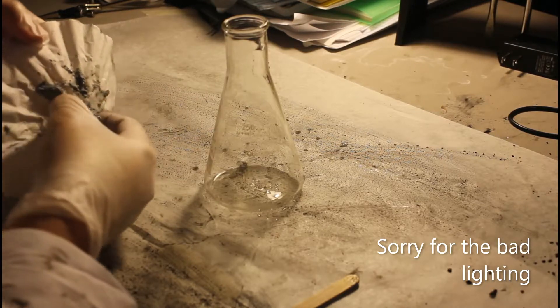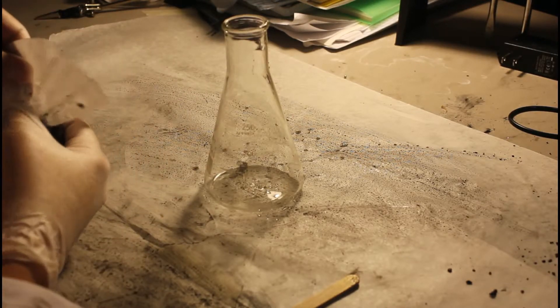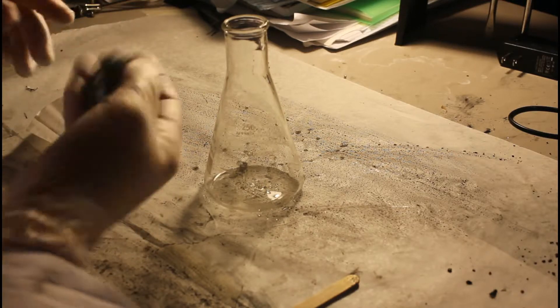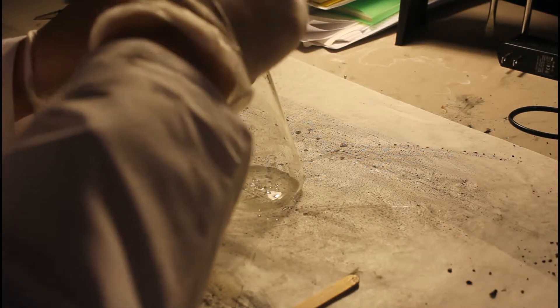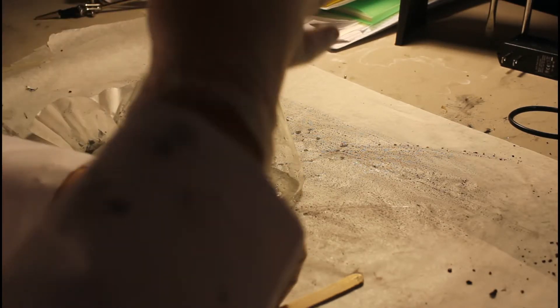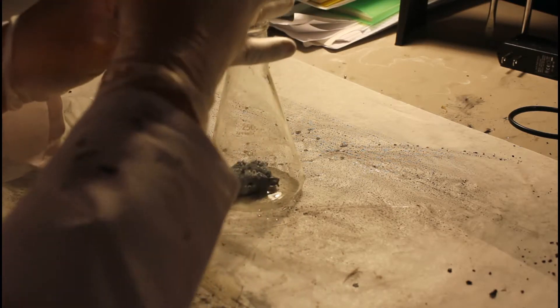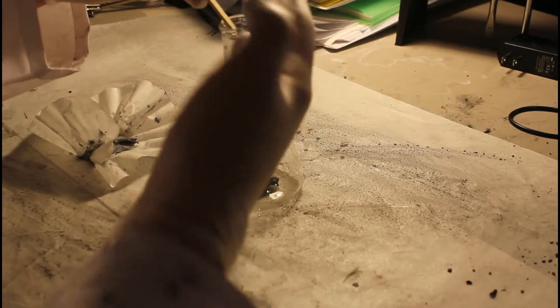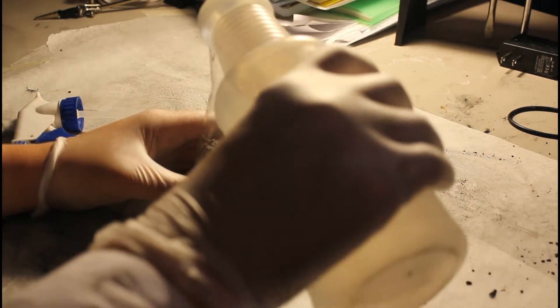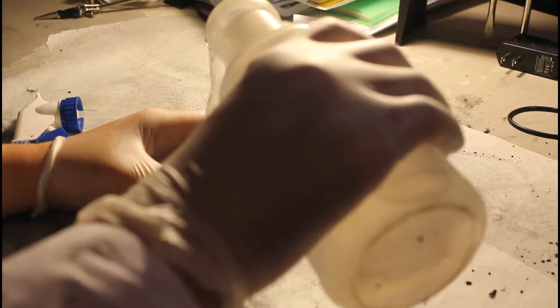First, the zinc paste we collected is added to a 250 milliliter Erlenmeyer flask. This will be the primary washing vessel. Once all of the zinc is in the flask, deionized water in a wash bottle is used to wash the paste off of the inside of the glass. The flask is then topped off to 250 milliliters with deionized water.